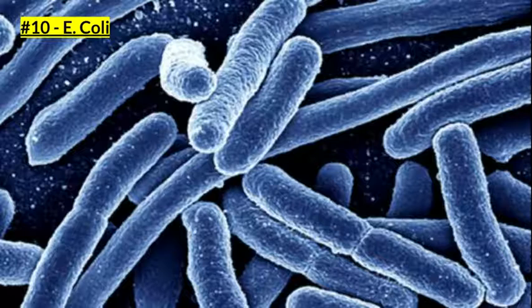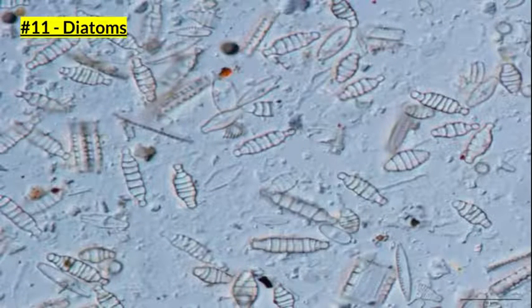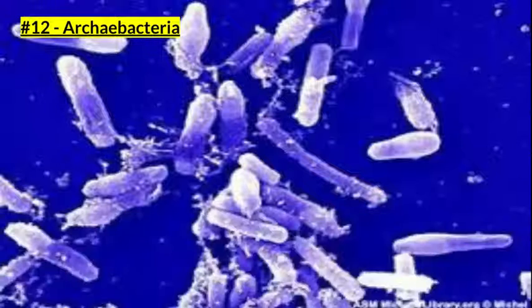Number 10 is E. coli. E. coli is a type of bacteria. Diatoms, which I said are algae. So this is actually the skeleton of diatoms. Diatoms are actually used in forensic studies. So say they find a victim in a particular area. Sometimes they study the types of diatoms on their shoes to see if they actually died in that area or were moved. So that's just a fun, interesting fact with diatoms.